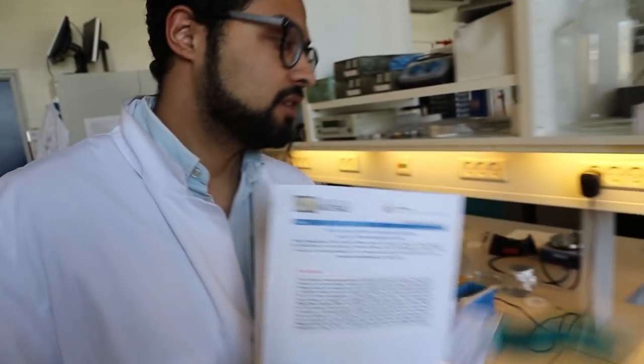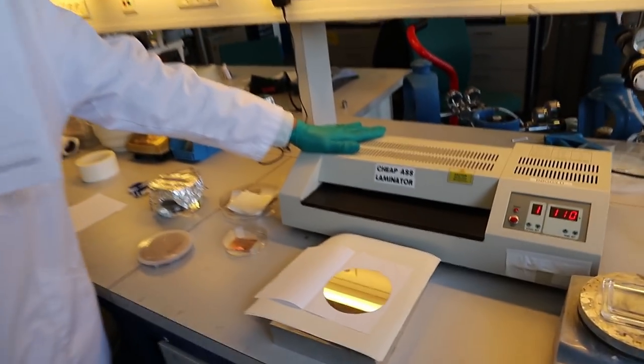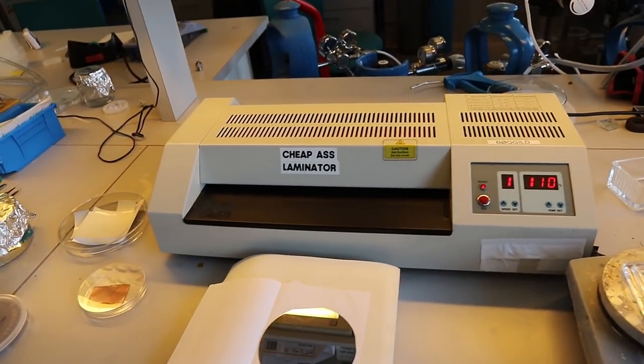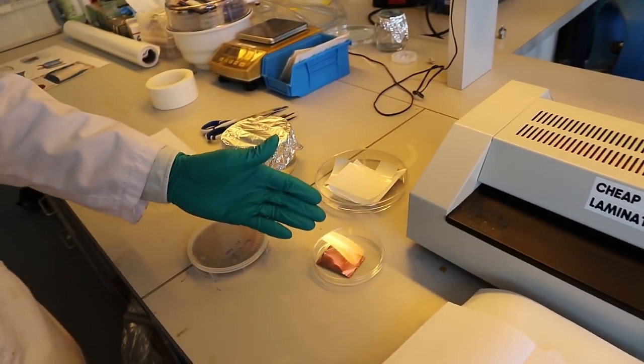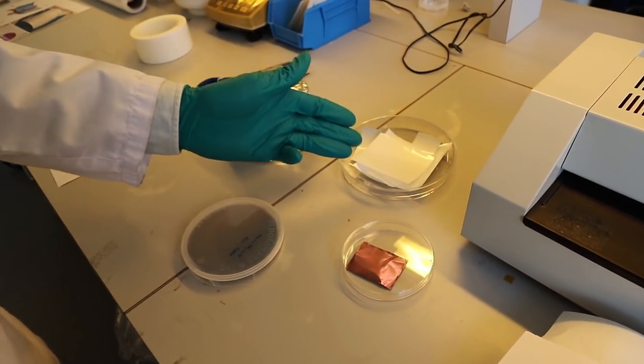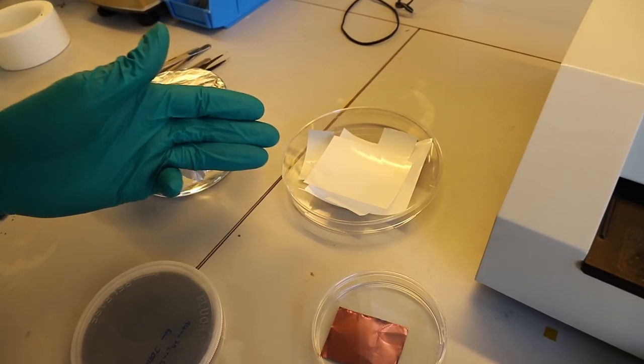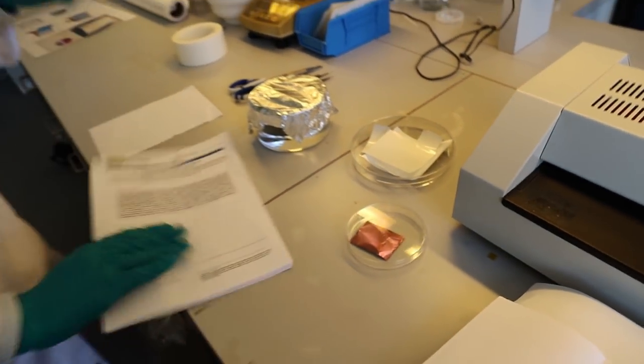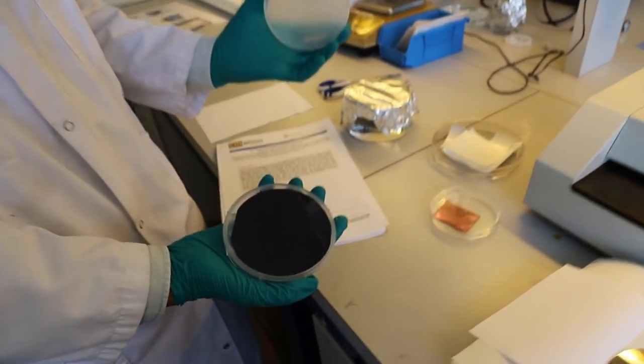We have here our commercial laminator, we have water, we have graphene on copper foil which we have oxidized in water overnight, and we have PVA foils which we are going to be using for our transfer. Our transfer today is going to be on a wafer of silicon dioxide.